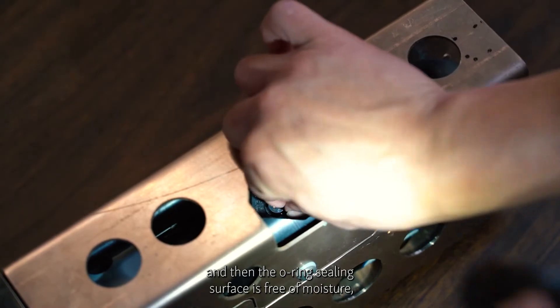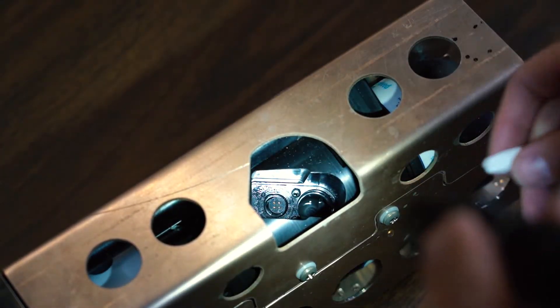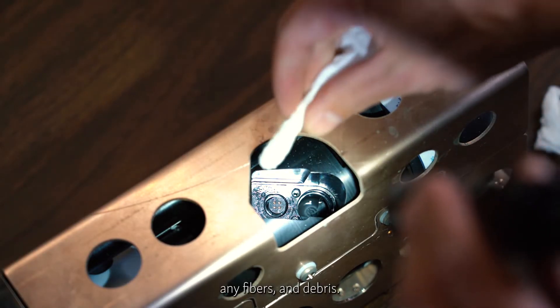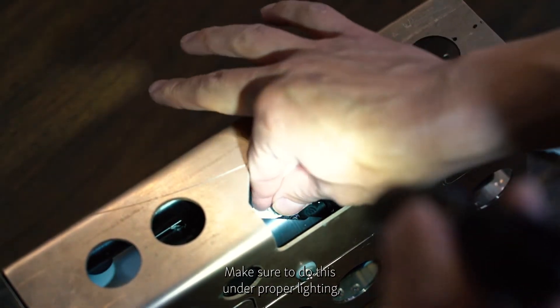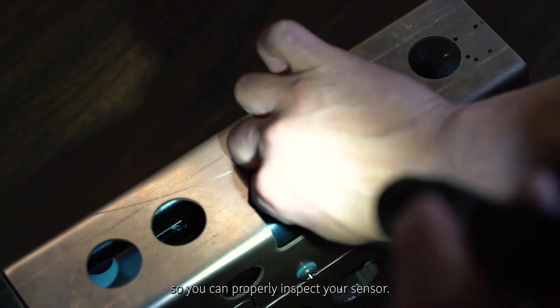Make sure the O-ring sealing surface is free of moisture, any fibers, and debris. Do this under proper lighting so you can properly inspect your sensor.